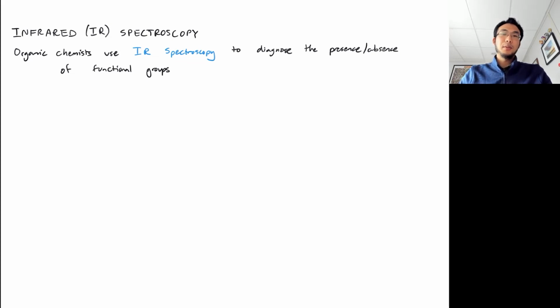In this video, we will learn about infrared spectroscopy, or IR spectroscopy. We'll learn about how it works, the fundamentals behind it, and then how organic chemists use infrared spectroscopy to learn a little bit more about the structure of the molecules that they're working with.